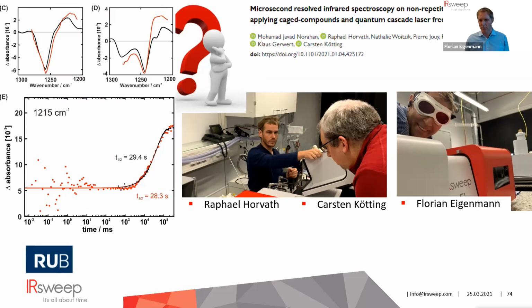So the high resolution spectroscopy, and here I really talk about better than 0.001 wave numbers. They have to be specifically characterized.